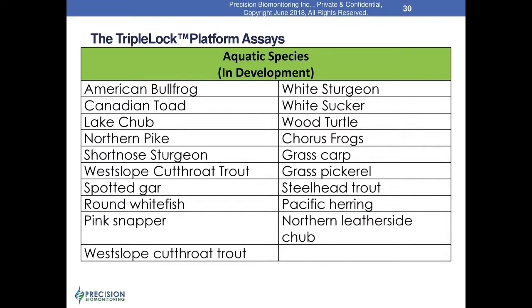Yeah, I would say that I do some work still at the University of Guelph, and I discuss these things with a lot of eDNA students there, one of whom is working on macroinvertebrates in certain ecosystems, and he's using a dual approach using targeted qPCR and metabarcoding. It seems to him and to me that insects are quite low-shedding organisms. So it may be that we need a multiple approach in terms of these taxa. I think in the first instance, metabarcoding is probably more preferable, given the extent that people would like to know about lots of different species within certain taxa, because some are more diagnostic than others about the health of an ecosystem. But yes, we have handled some benthic samples before, and we have metabarcoded them. So that is something we do.